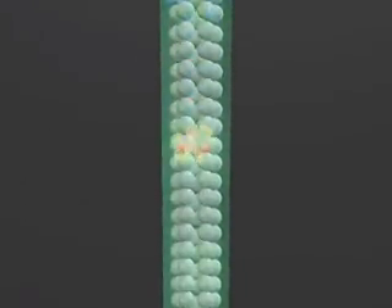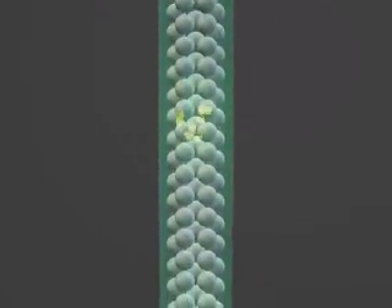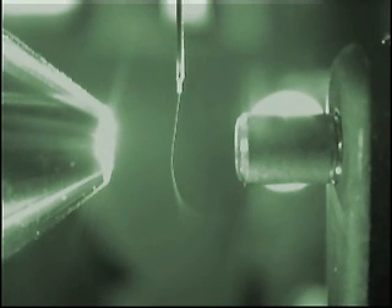The peptides are separated, just like on a conventional nano-flow column. Reduced peak dispersion yields better separation efficiency and sensitivity. The integrated electro-spray tip ensures reproducible nebulization of the effluent, vital for optimum ionization of compounds and best results.